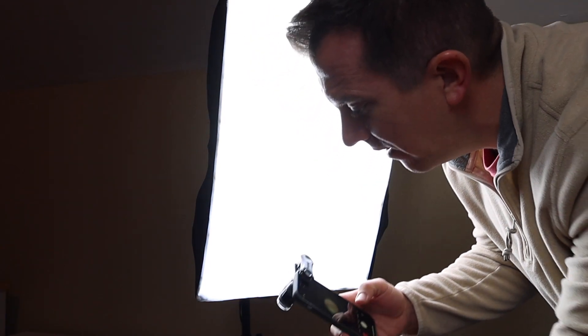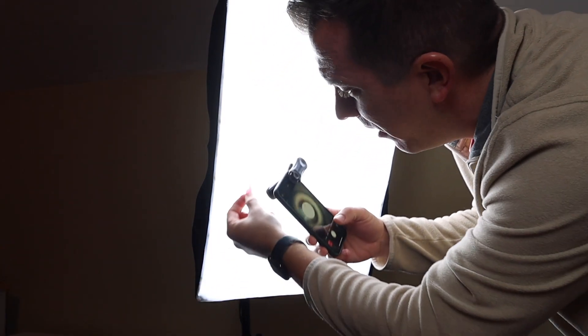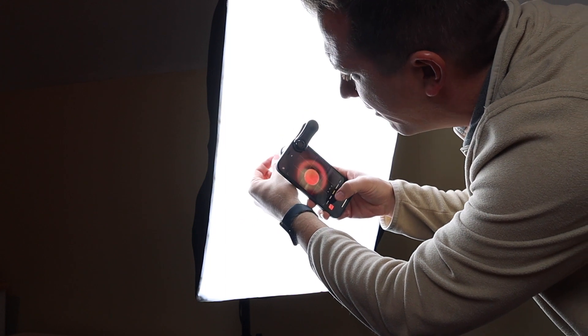In the studio, we used one of our studio lights — and it's even something as simple as hand-holding it behind the sample. When you do it that way, you'll be able to see the cell membranes far more easily, which makes it easier to distinguish each cell border. Here I've slowed down the video so much that you can see the rolling shutter of the iPhone, but you get the idea of how clearly you can see the individual plant cells.